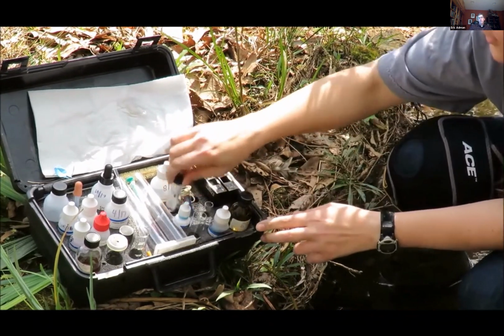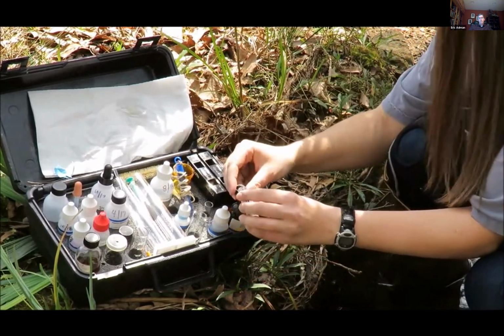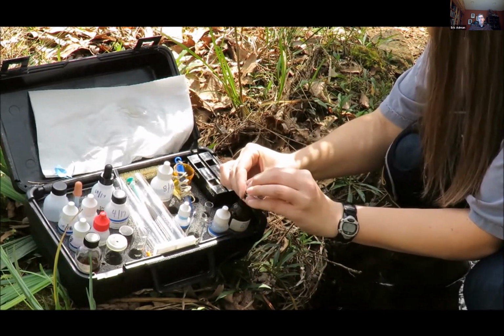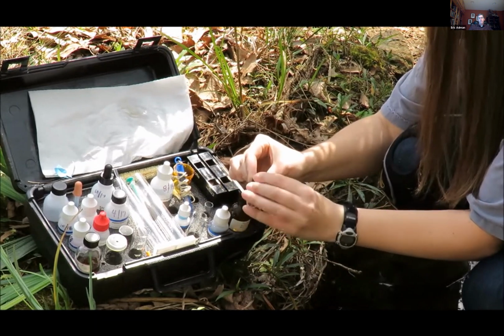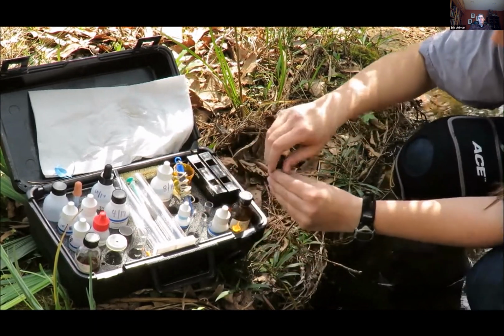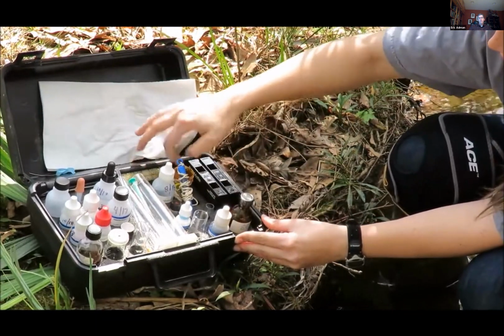Locate the hardness reagent number 6 tablet bottle. This reagent is in tablet form and is very soluble. Take extra care to not touch the tablet or allow any water to enter the tablet bottle. Using the cap of the bottle, dispense a single tablet into the water sample. Cap and shake the tube until the tablet dissolves.